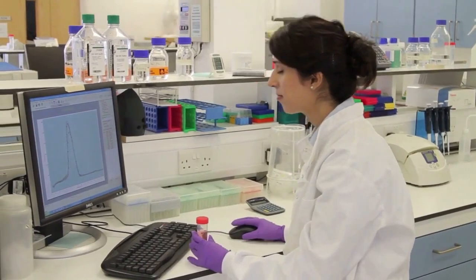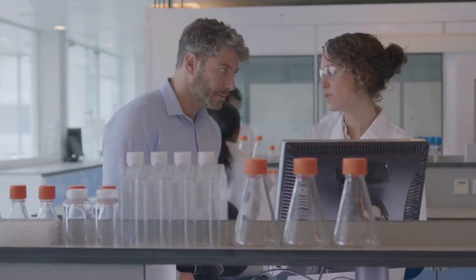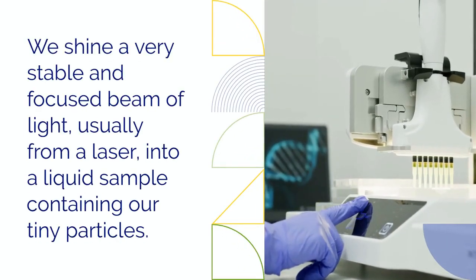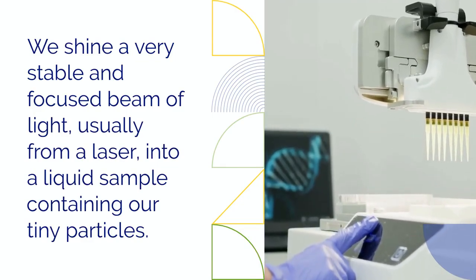At its heart, static light scattering, or SLS, is surprisingly straightforward. Imagine shining a flashlight into a dark, dusty room. You don't see the individual dust particles, but you see the light they scatter. SLS works on the same principle. We shine a very stable and focused beam of light, usually from a laser, into a liquid sample containing our tiny particles. When this light hits a particle, it gets scattered in all directions. A sensitive detector then measures the intensity, or brightness, of this scattered light.